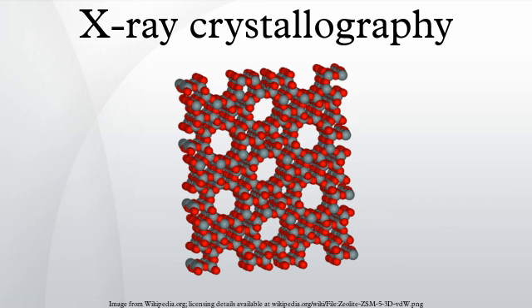Data collection, mounting the crystal. The crystal is mounted for measurements so that it may be held in the X-ray beam and rotated. There are several methods of mounting. In the past, crystals were loaded into glass capillaries with the crystallization solution. Nowadays, crystals of small molecules are typically attached with oil or glue to a glass fiber or a loop, which is made of nylon or plastic and attached to a solid rod.